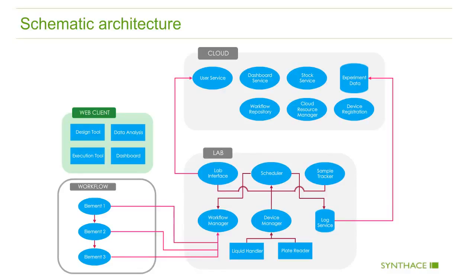The device manager itself ultimately is talking to your various pieces of lab equipment via our device drivers, which themselves are network services. So you can be talking to the laboratory control PCs that might be connected to a device in another room, assuming your IT department is willing to let you connect up to the network.